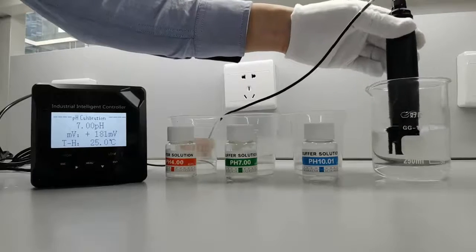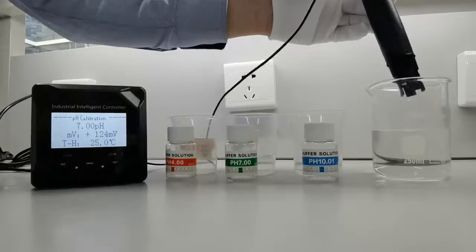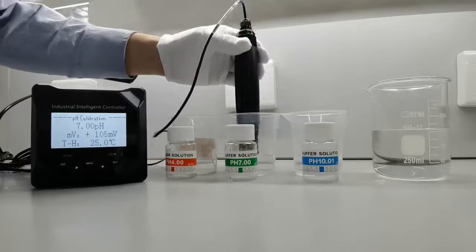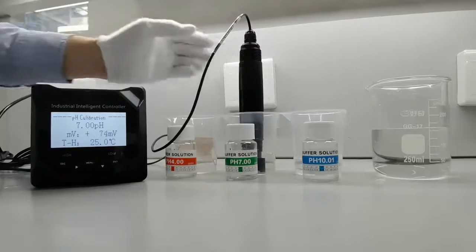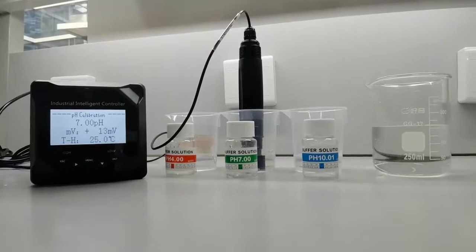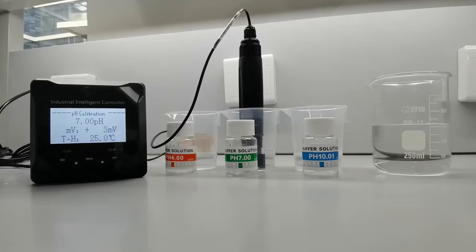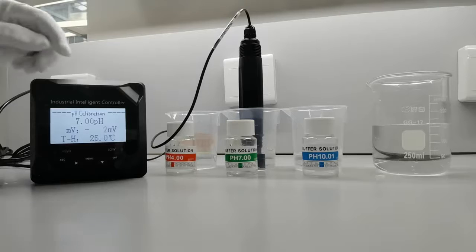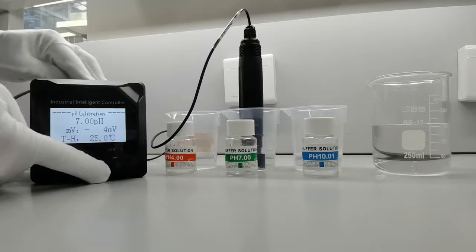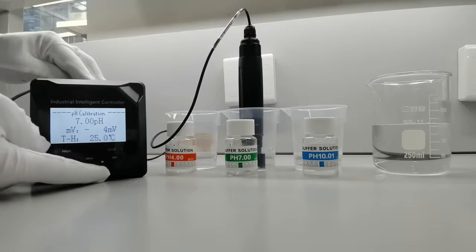Immerse the electrode in pH 7 solution and wait until the measurement is stable. After the measurement is stable, press enter.